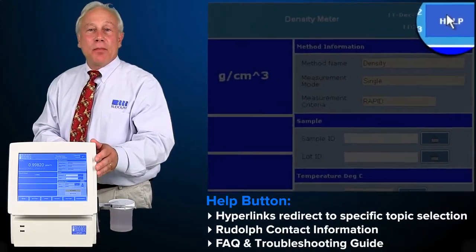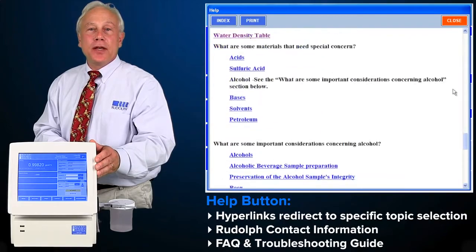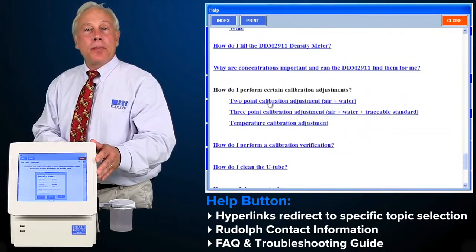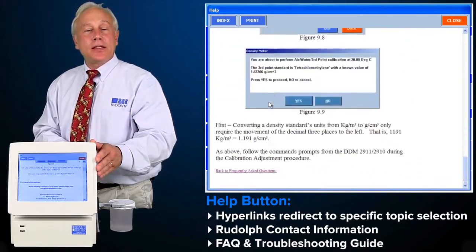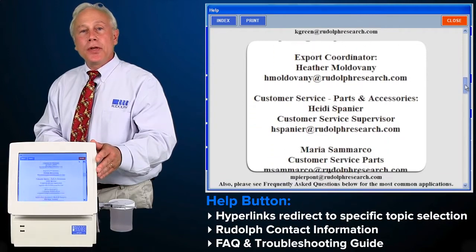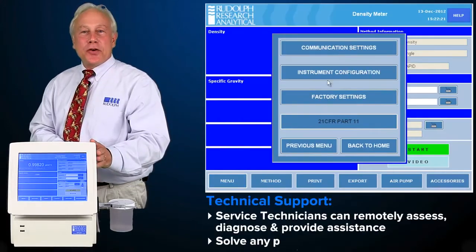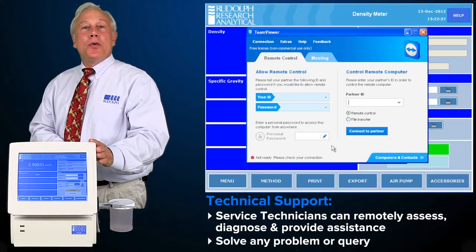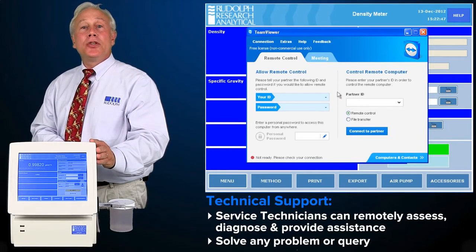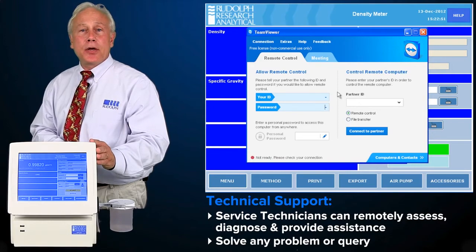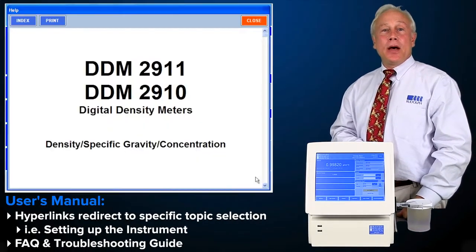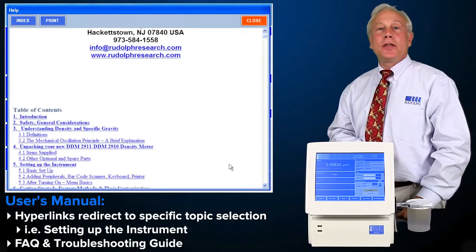Rudolph has added a help button located on the home screen. This help button provides an electronic link to a copy of the user's manual and has complete contact information for Rudolph. There's also a troubleshooting guide available. A desktop sharing program is also available, whereby our service technicians may connect directly with your density meter and provide help, training, or diagnostics as required. The electronic copy of the user manual has HTML files linking you directly to the topic of interest.